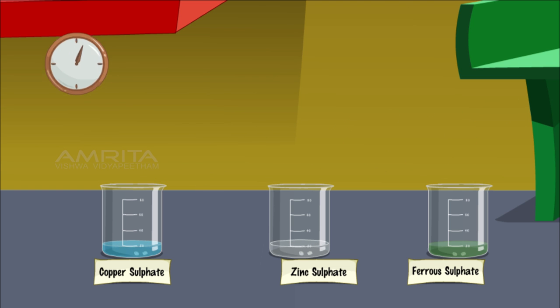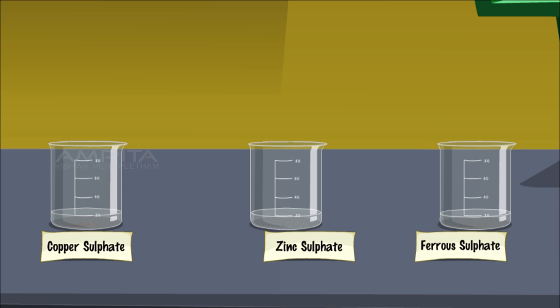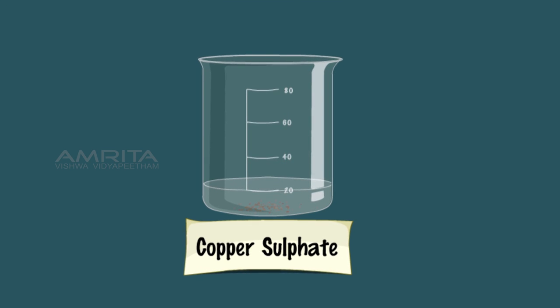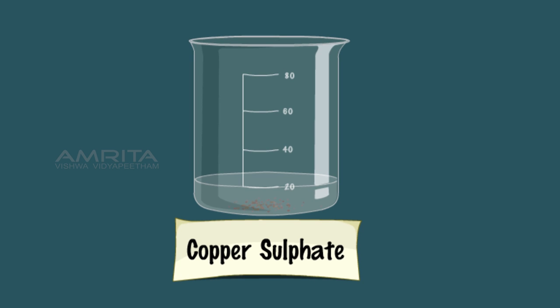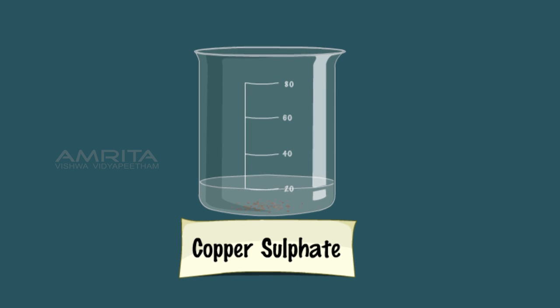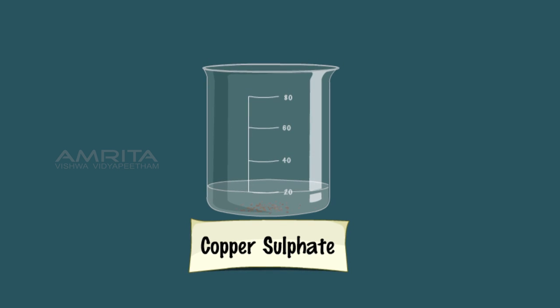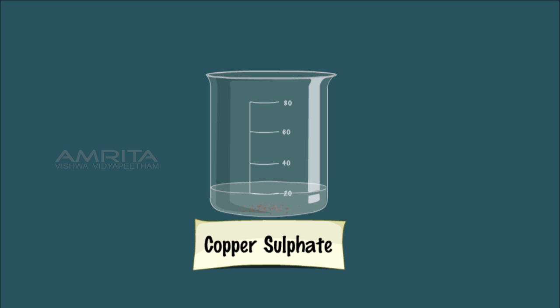Leave the beakers undisturbed for an hour and note the changes in colour of the solutions and the appearance of the metal. In the case of copper sulphate solution, the blue colour disappears and red-brown particles of copper settle down at the bottom of the beaker. This indicates that Al is more reactive than Cu and it can displace Cu from CuSO4 solution and form a colourless solution of Al2(SO4)3.